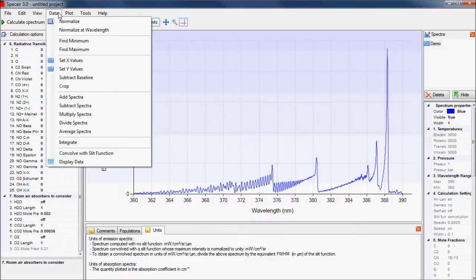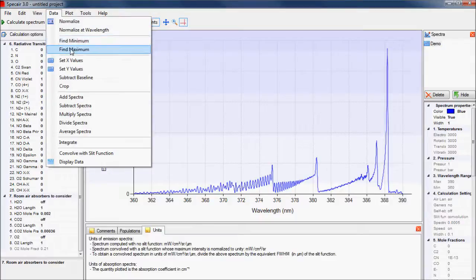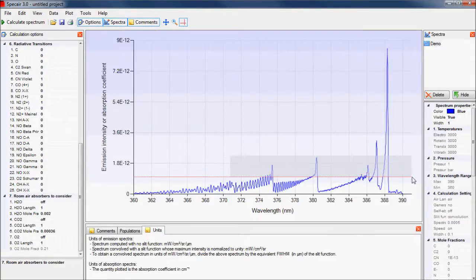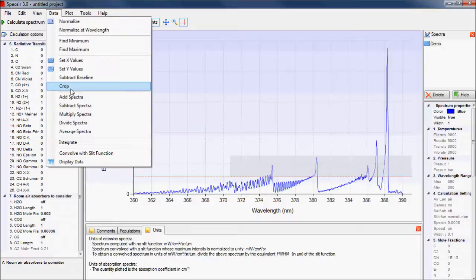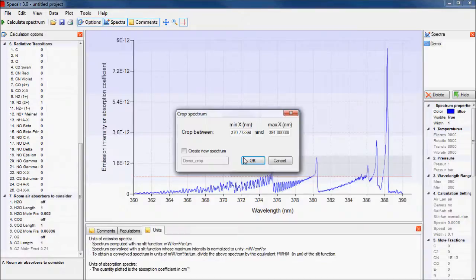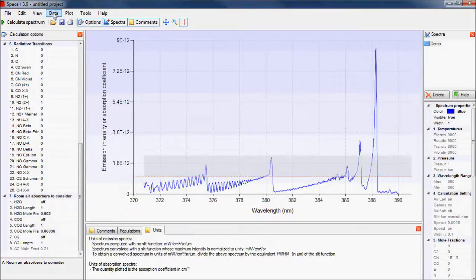The data menu has options for normalizing your spectrum, for quickly finding minimum and maximum values, and for adjusting experimental offsets. By selecting regions with the markers, we can also crop a spectrum.